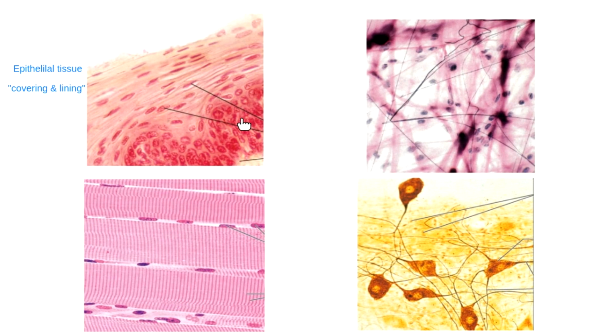Another type of tissue that is pretty much entirely made out of cells is this image that we see down here. This is an image of muscle tissue. Now, muscle tissue is made out of cells. These cells are, in the case at least of this type of muscle tissue, long and cylindrical cells. But the big thing for you to know about the cells in muscle tissue is that the cells are filled with proteins.